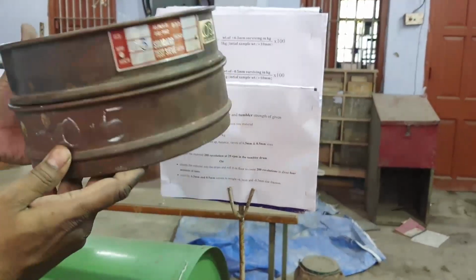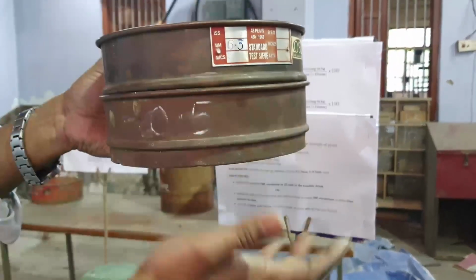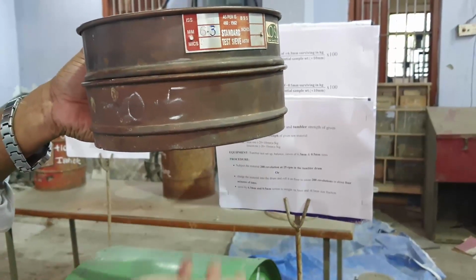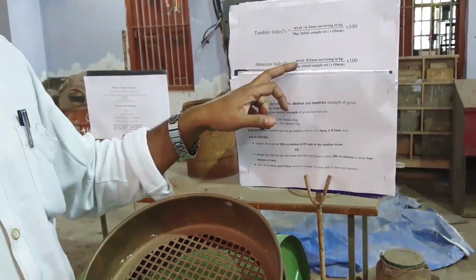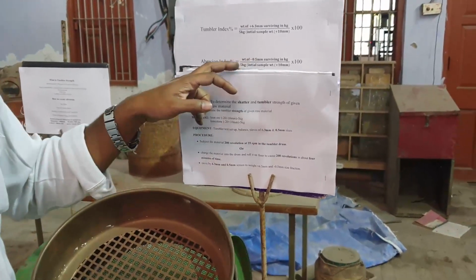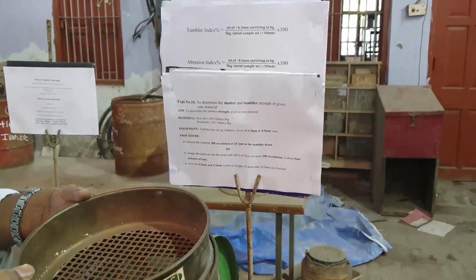For the abrasion index, because this is the 0.5 mm screen, the weight of the material passed through this 0.5 mm screen will be the minus 0.5. That weight fraction passing through the 0.5 screen, we keep in the numerator of this abrasion index percentage formula, then divided by the initial weight we are taking, that is 5 kg, into 100, will give the abrasion index.